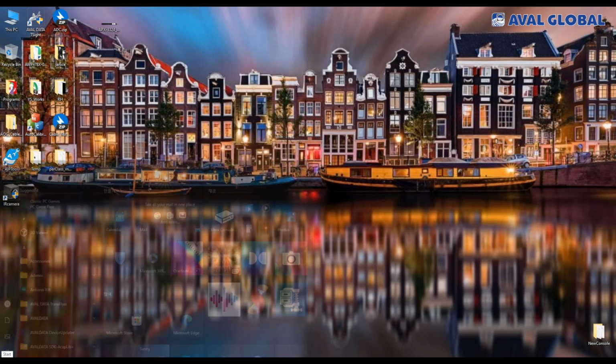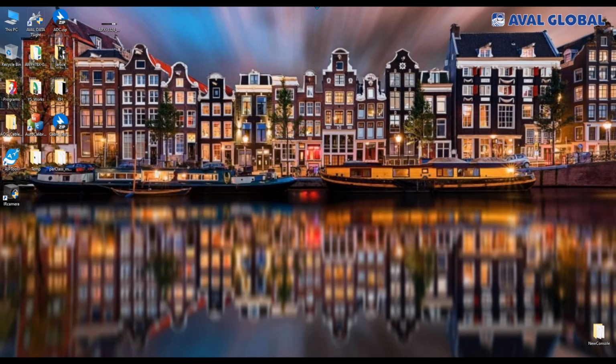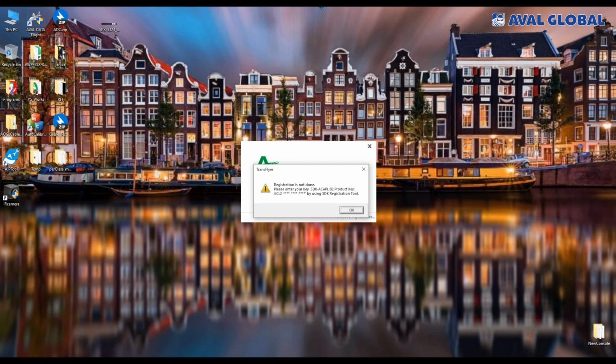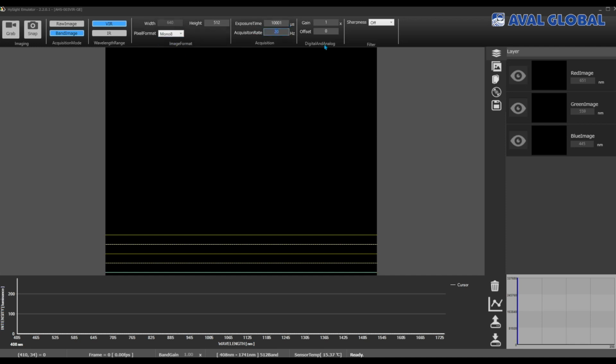Run HySight. To demonstrate smoothly, we will change the settings in advance. I will explain it sequentially.